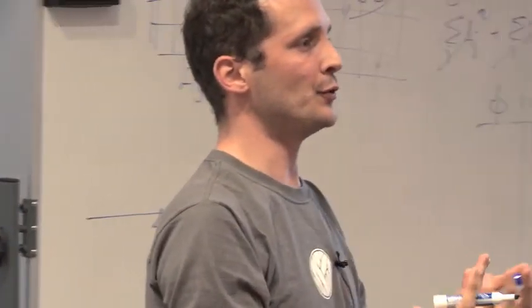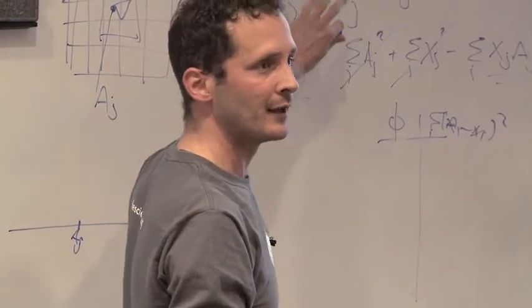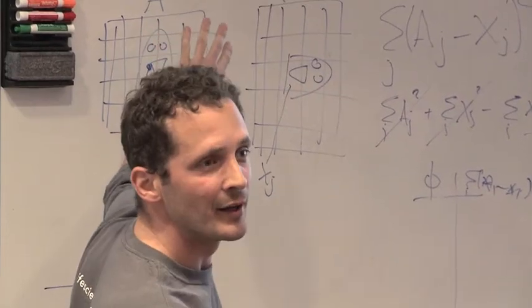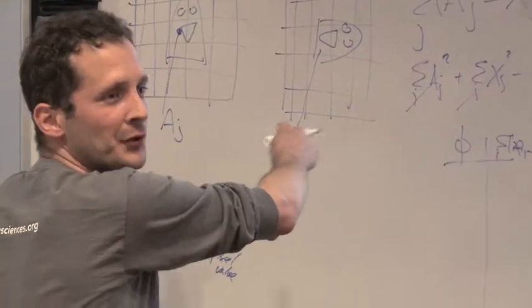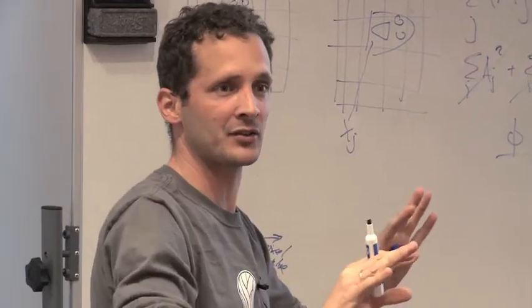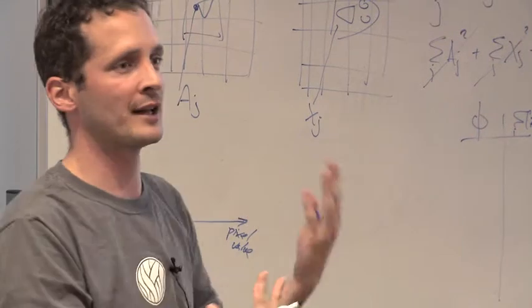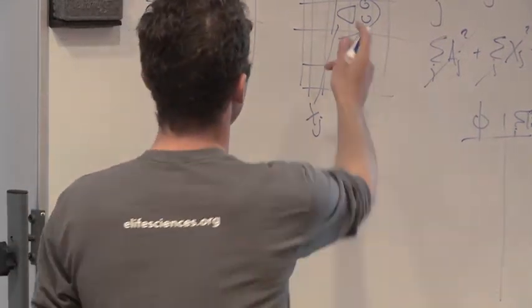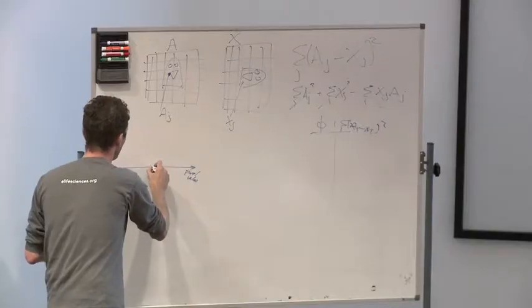Now, if I assume that there is Gaussian noise on top of this image, and if I assume this is the correct underlying signal for this image, which it isn't as you can see, okay? But let's just assume for now this is the correct image. Then the most likely pixel value for pixel j would be the value aj, okay?